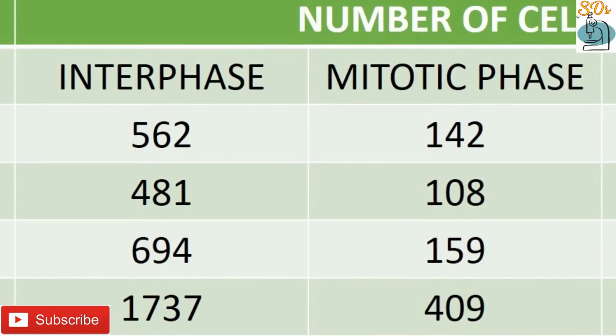Here is the calculation for the mitotic index. Mitotic index equals n by capital N into 100. Mitotic index is used to quantify the differences in cell division when environmental parameters are changed.